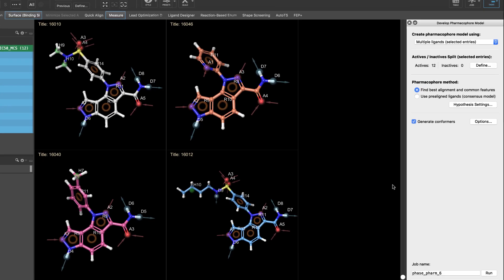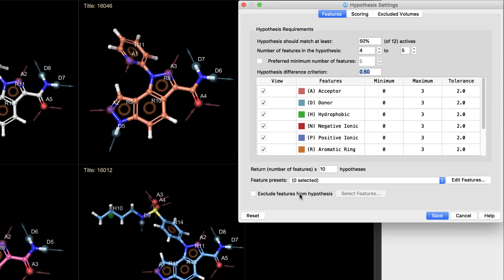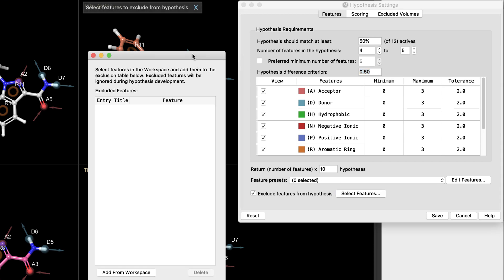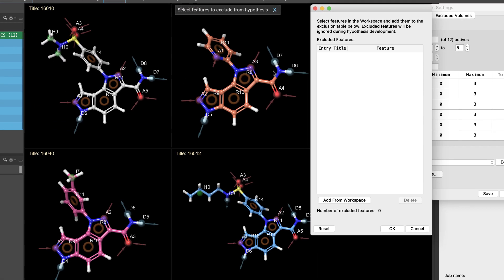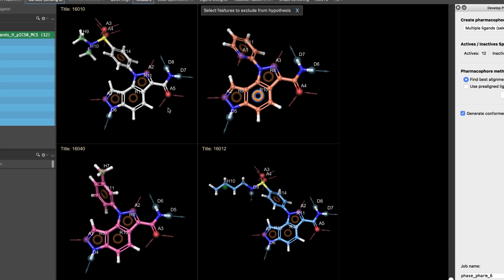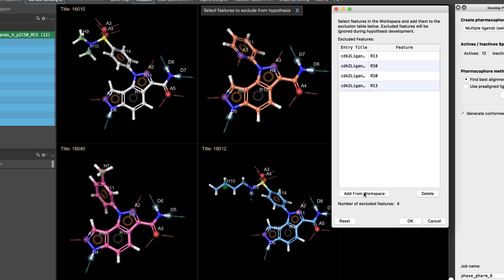Over in Pharmacophore modeling, a new option to exclude specific features from being considered in a hypothesis is now available. Select the features you wish to exclude and then add them to the table. These features will then be ignored during hypothesis development.